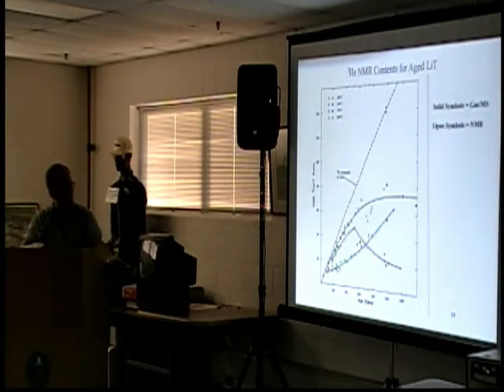And at 75 degrees C, you were releasing a lot of helium, even at an early stage, and then over a period of time it would come out. 100 degrees C was somewhat different. You were actually retaining a lot of the helium until a certain point, then you released it at a later time. What this showed was a fairly complicated temporal dependence of relaxation time and/or concentration.